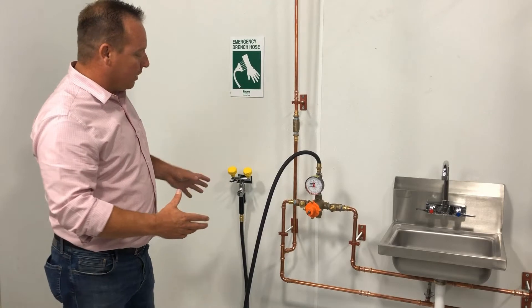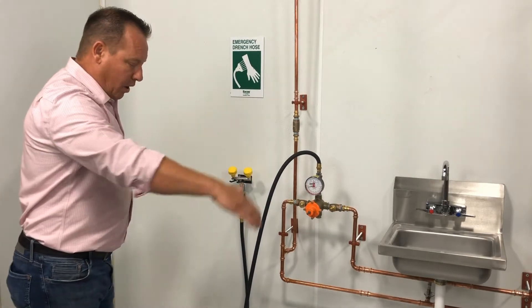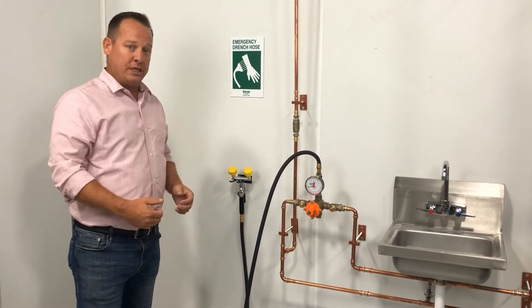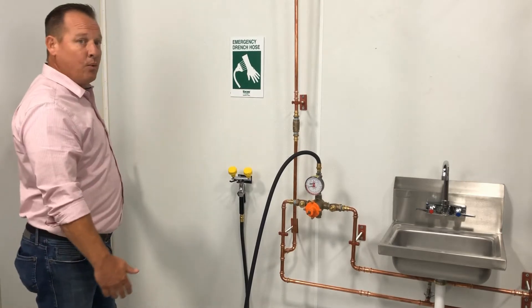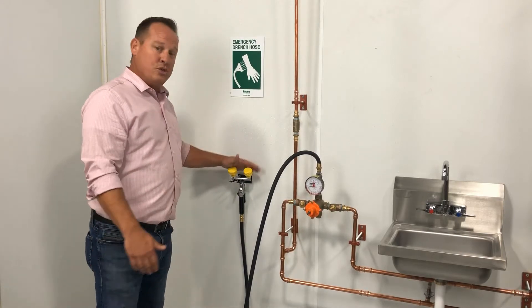The first thing you want to do when you're installing one of these devices is choose your location. You're going to want that in a very open area. You don't want a bunch of devices or anything that's going to obstruct anybody from getting to and using it. Some of the other requirements is to make sure that you're a minimum six inches away from any wall or minimum six inches away from any obstruction that's going to stop somebody from coming up and using this device.